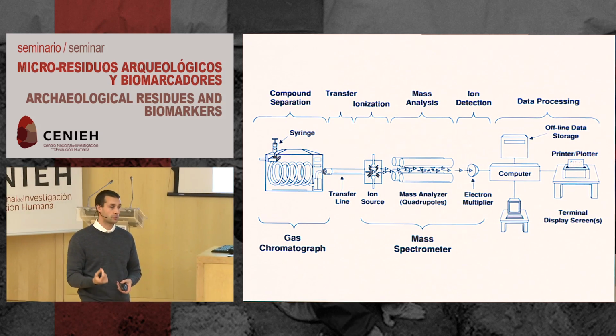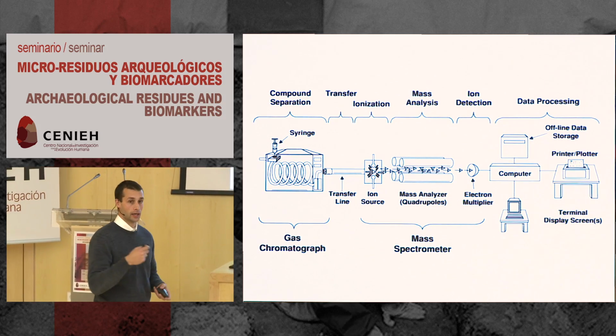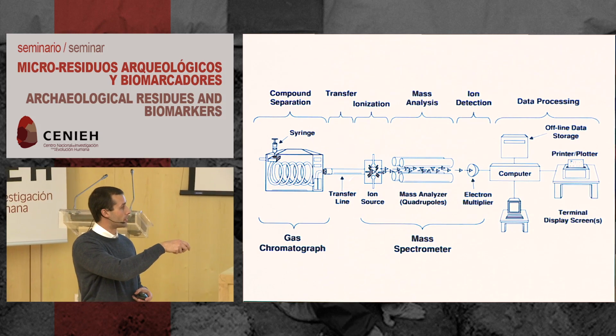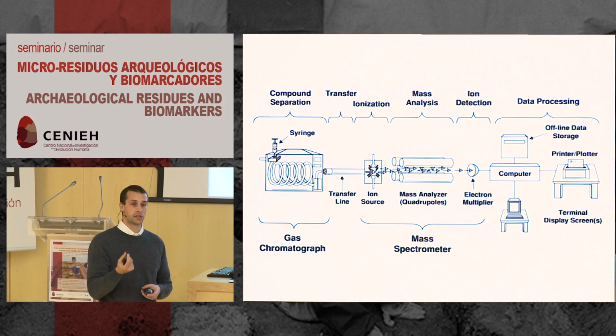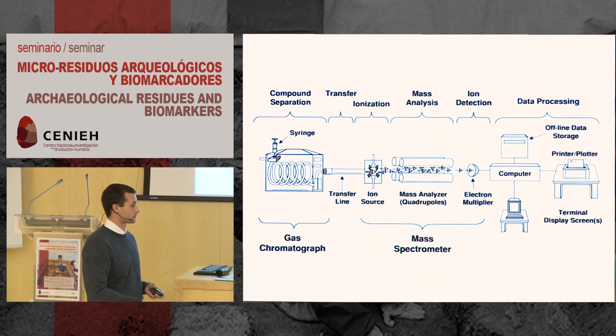That temperature is enough to break apart most compounds that we're interested in through time. So over time and through temperature, your compounds break out. It is then transferred through our analyzer where those ions are picked up and identified. And then the abundance is typically brought out on our computers, our readouts.